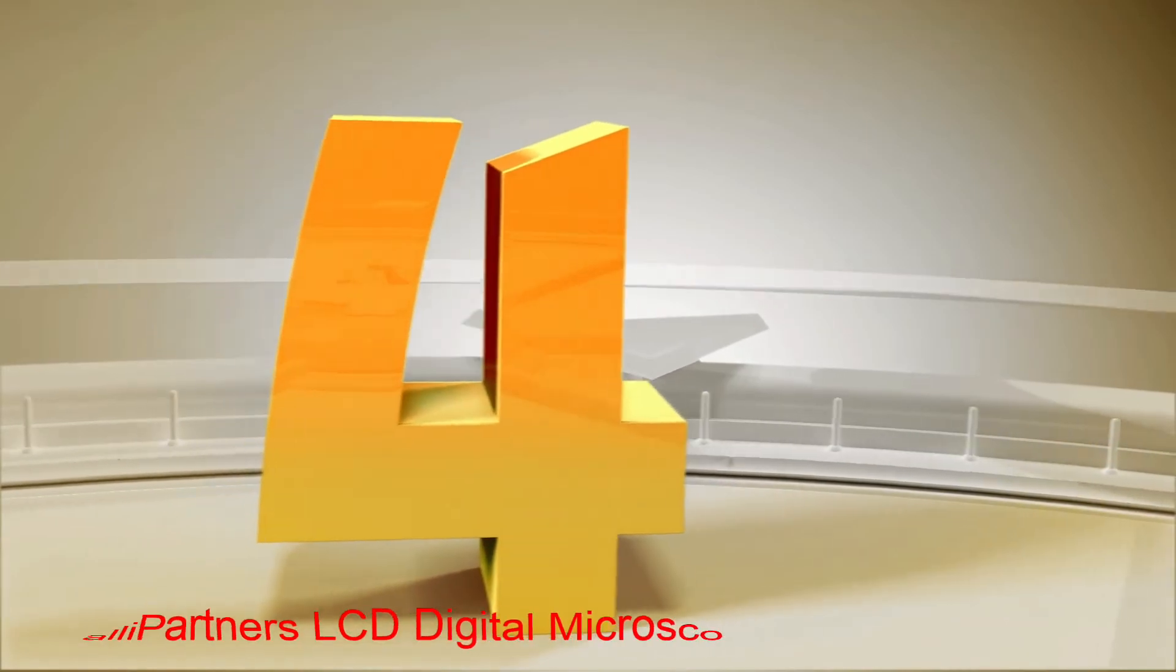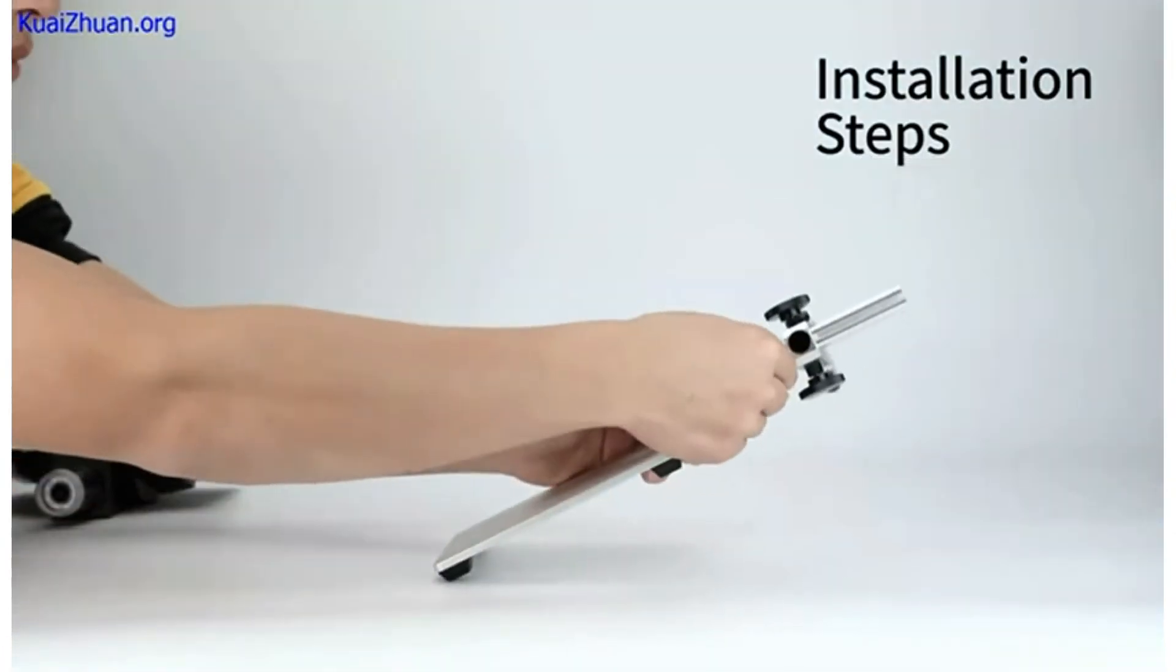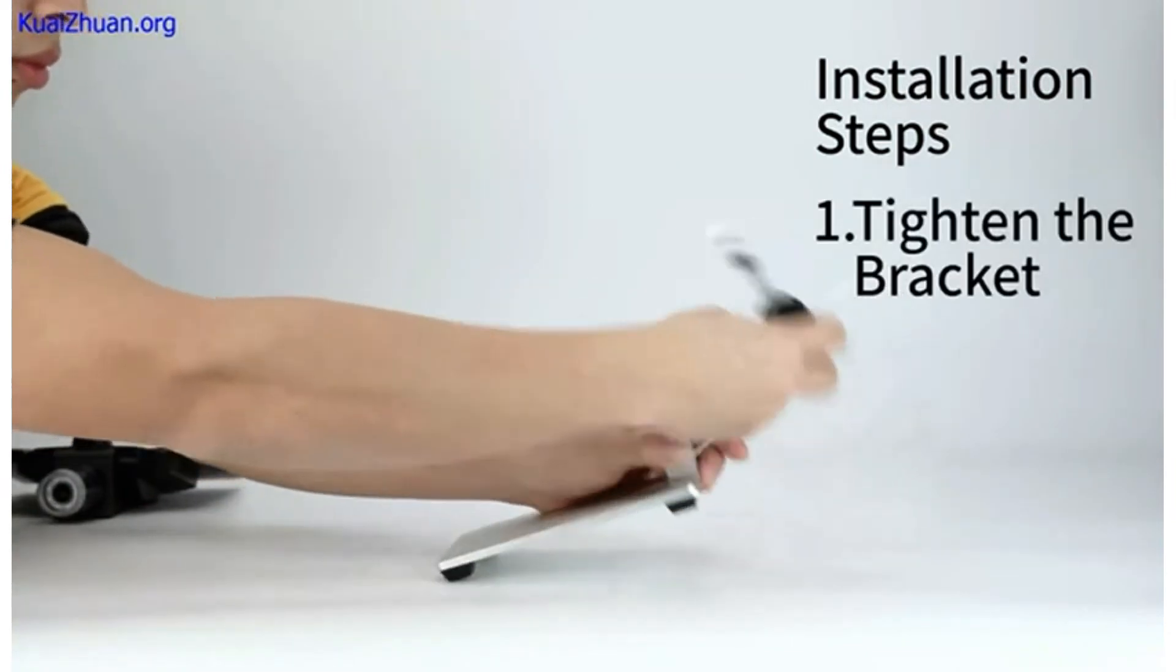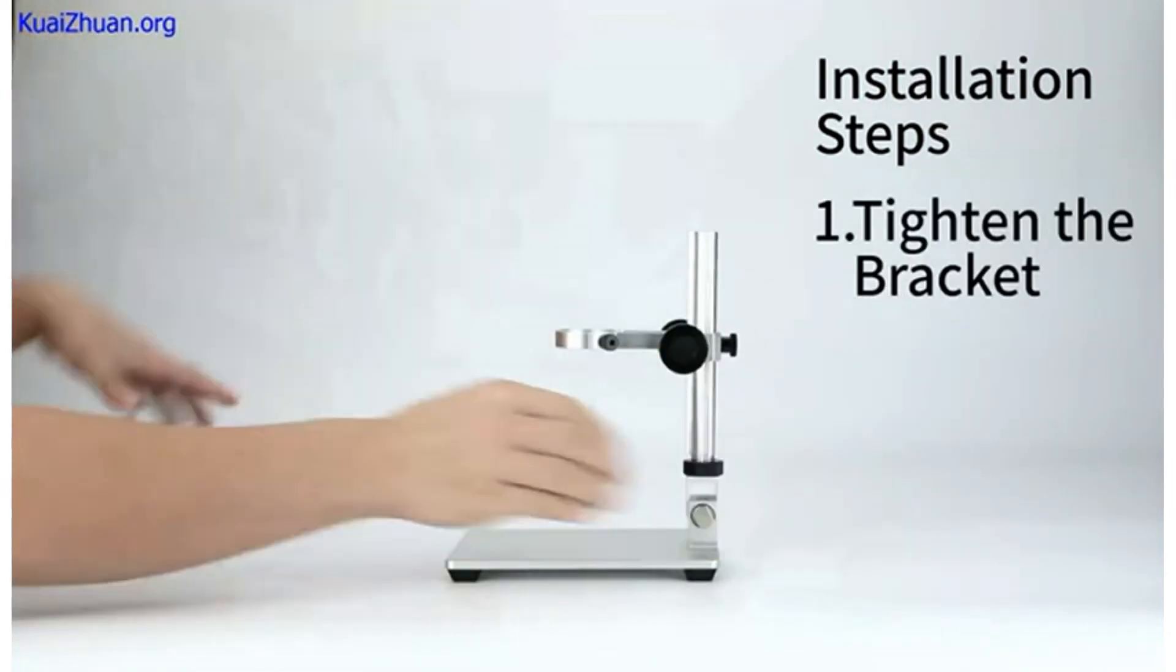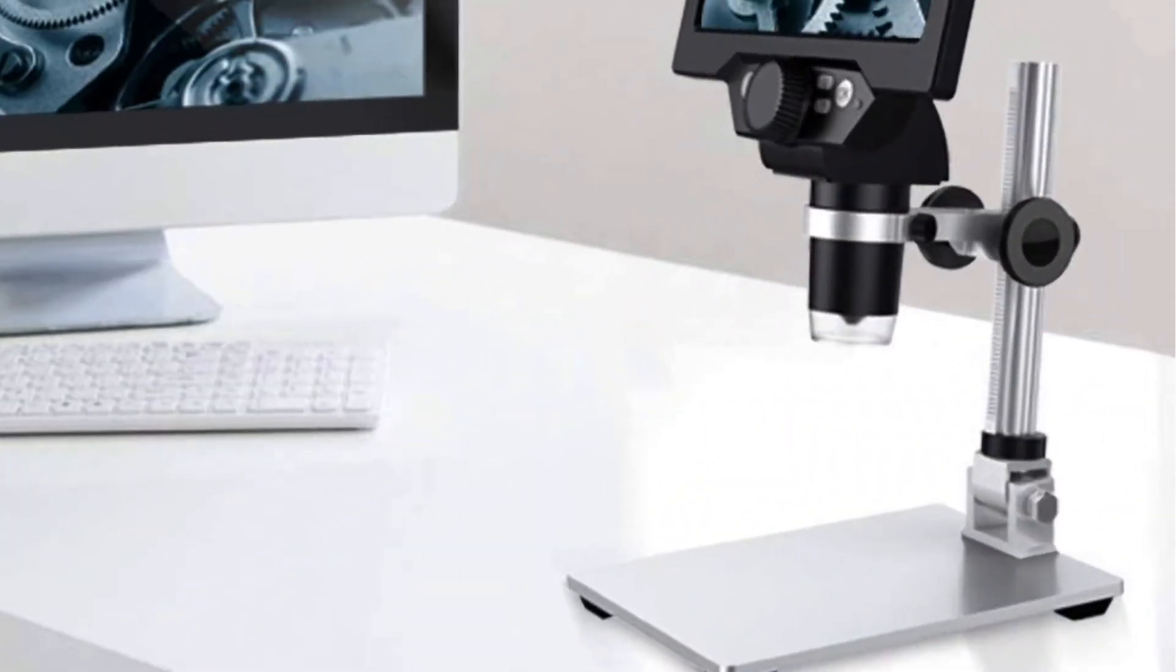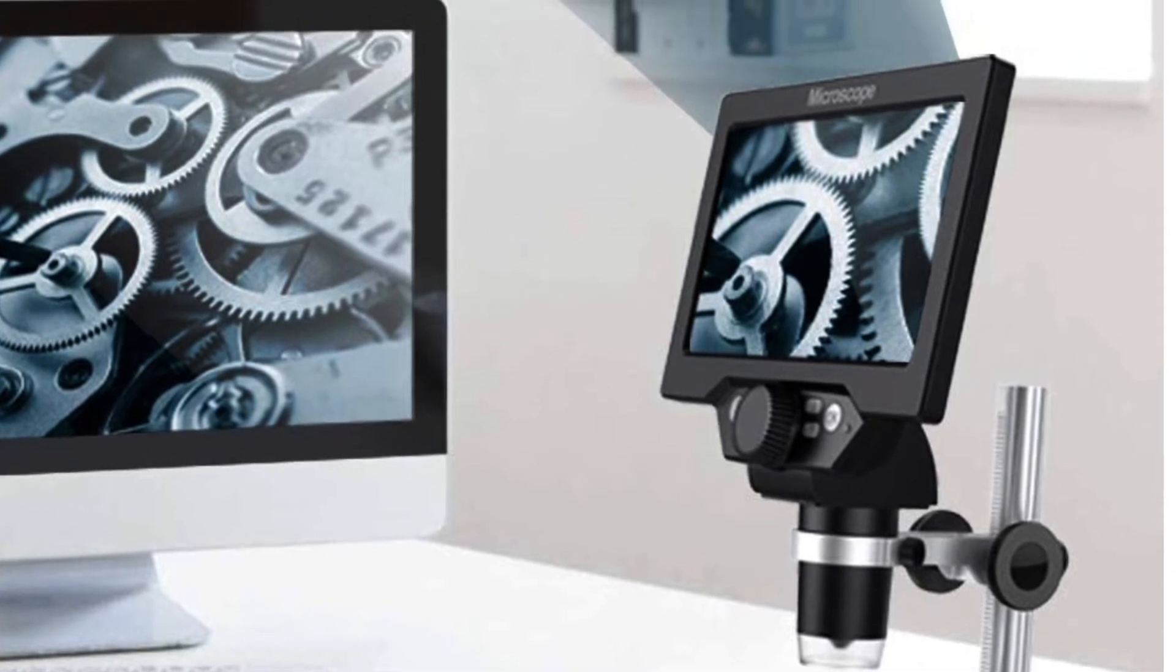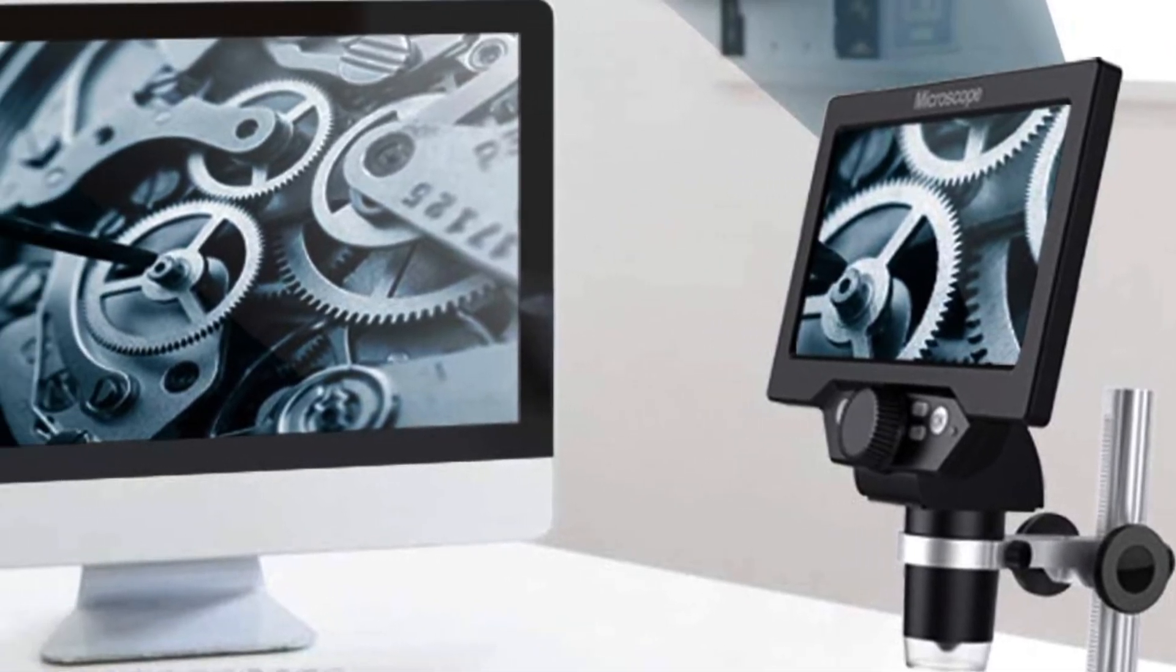Number 4. Pallypartner's LCD Digital Microscope. Pallypartner's offers a wide range of electronic products which also includes feature-rich digital microscopes which can be a viable high-performance option for many buyers. The Pallypartner's digital USB microscope comes at the fourth position of this list as it can be a great feature-rich option for many.